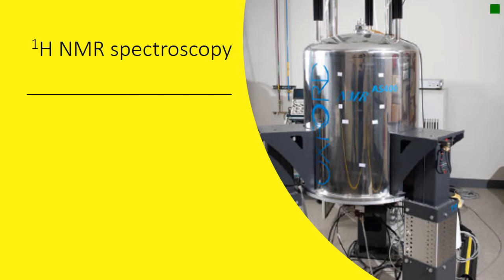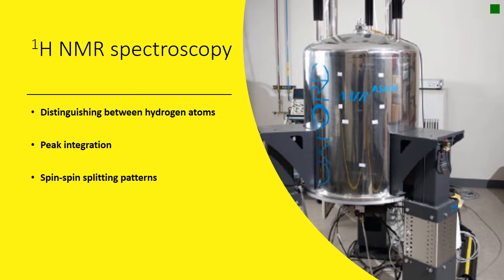So in today's video we are going to do some more on distinguishing between hydrogen atoms. We started that in the previous video. But we're also going to have a look at peak integration. Integration being the area under the curve. You will have come across that in maths. And lastly, we're going to have a look at spin-spin splitting patterns to look at how many hydrogens are in adjacent groups.